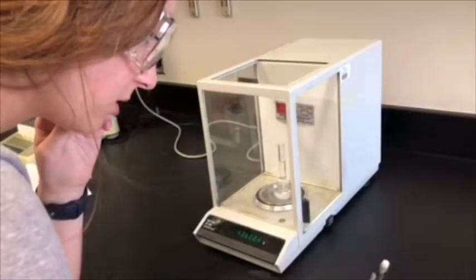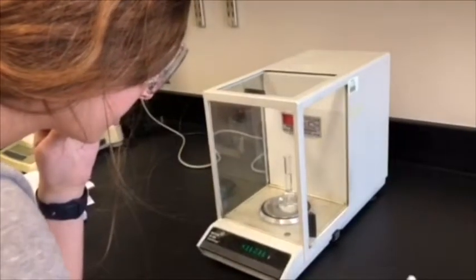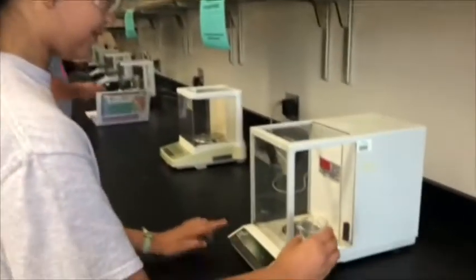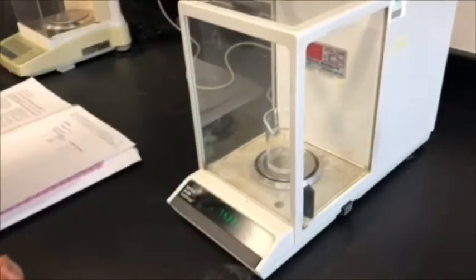To find the mass of a liquid, you must weigh it. However, you can't just measure a liquid outside of a vessel. It would be too messy. As a result, we must first find the mass of an empty beaker. This way, when we find the mass of the liquid in the beaker, we can account for the weight of the beaker and find the mass of just the liquid.